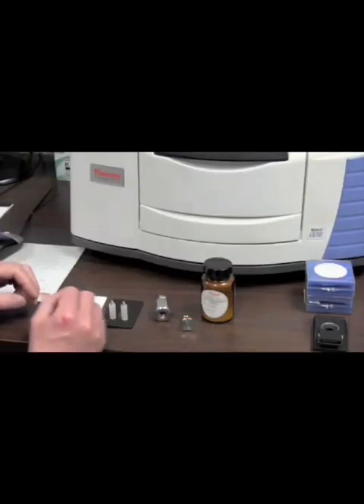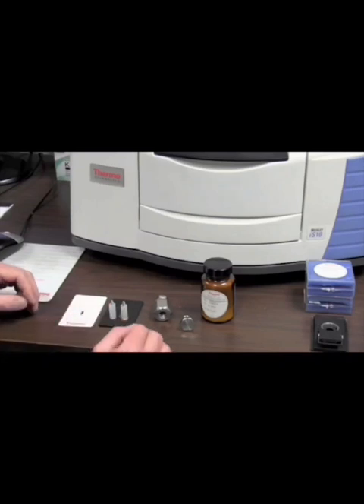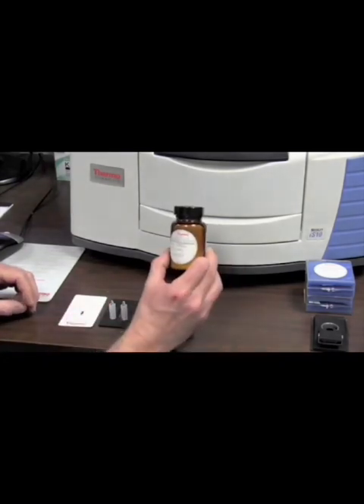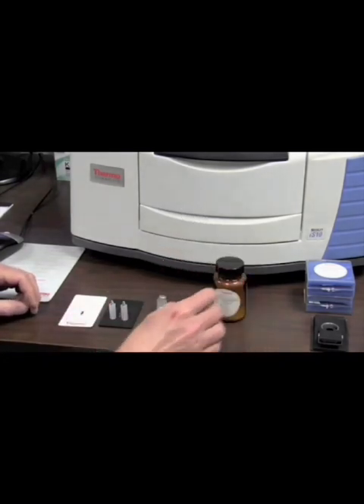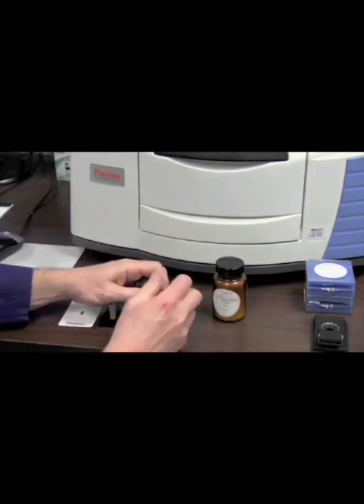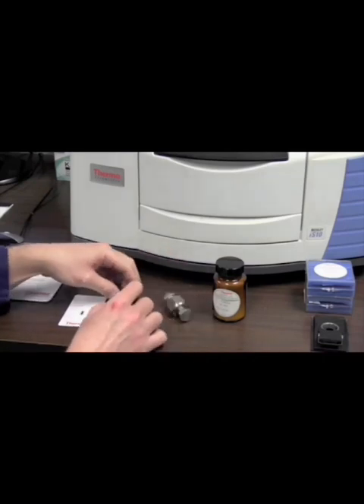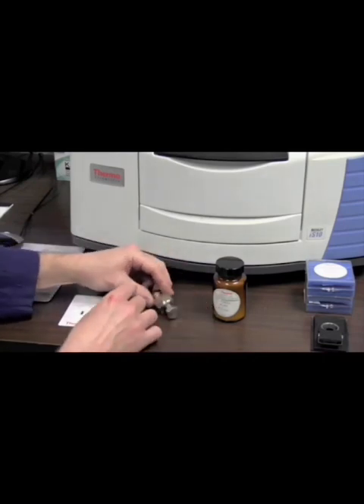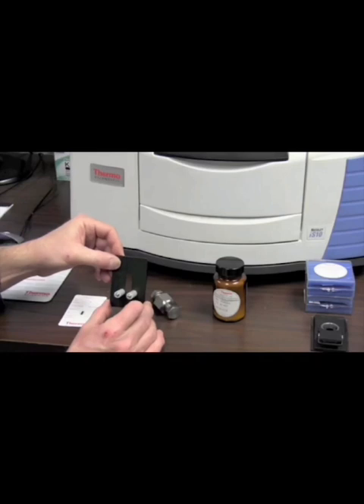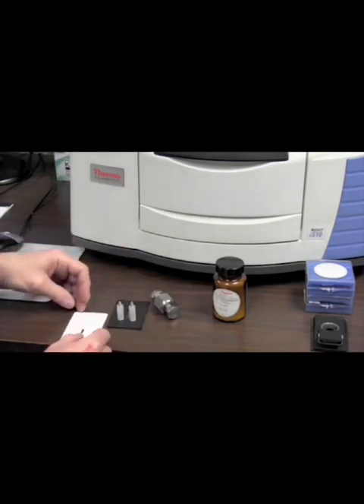The sample preparation is different depending on the sample type, whether in solid, liquid, or gas phase. To test a solid sample, it must be finely ground and mixed with potassium bromide powder (KBr). Meanwhile, for a liquid sample, you can directly drop the liquid sample on an IR transparent salt plate or mix the sample with a chosen solvent. Then gas samples require a special gas cell with an IR transparent window.